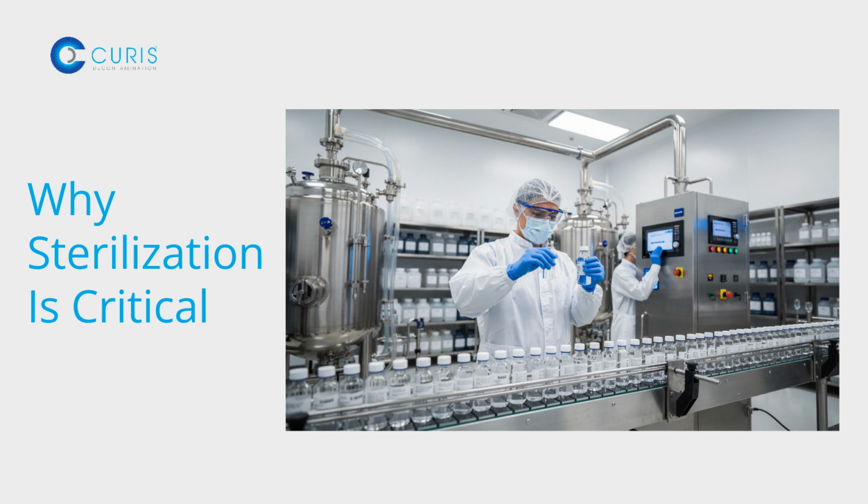This is especially critical for injectable drugs, implantable devices, and other products that directly interact with the human body. From reusable tools to single-use components and ISO Class 5 critical zones, sterilization underpins every aspect of aseptic processing and protects both product integrity and organizational reputation.